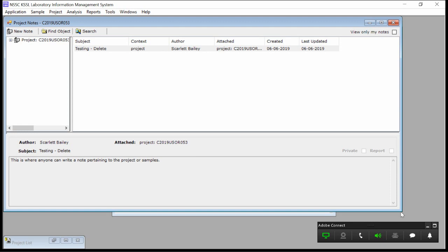If you look in the notes, we try to make notes where maybe the sample ran out or there wasn't enough to do, or maybe it was a problem sample where New Zealand couldn't be done because 5 grams would soak it all up. So you can look in there if you're missing data and you don't know why, there may be a note there.